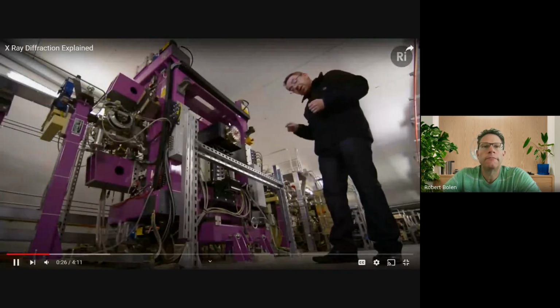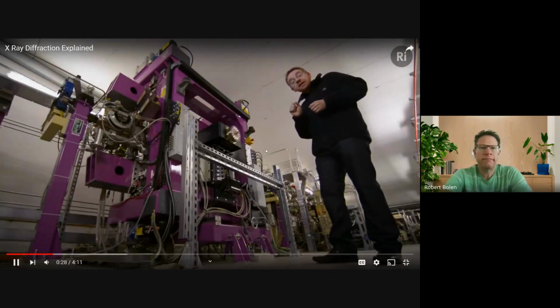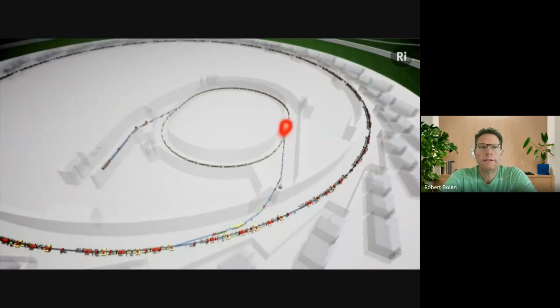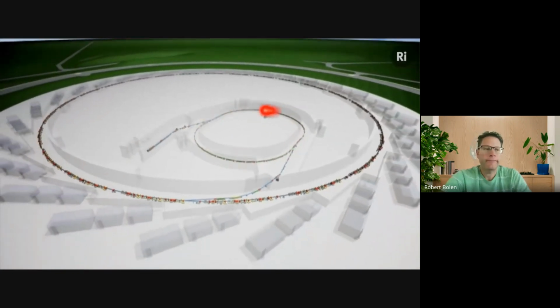And as they wiggle, they produce an intense pulse of electromagnetic radiation in the form of X-rays, and that pulse of X-rays shoots straight into one of the lead-lined experimental hatches where visiting scientists carry out their diffraction experiments.